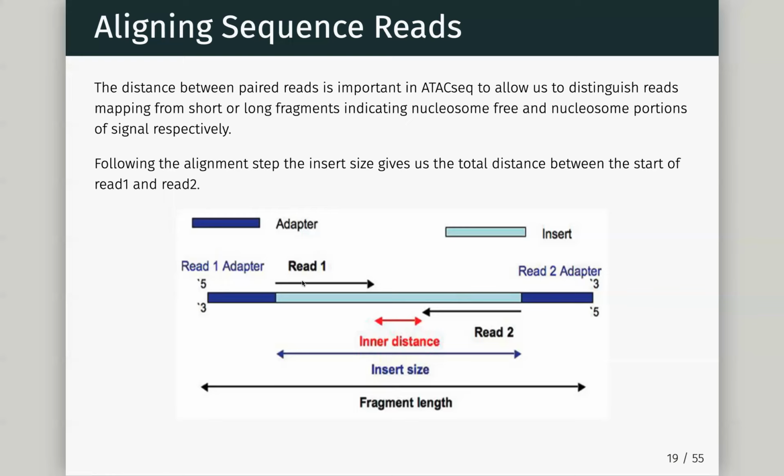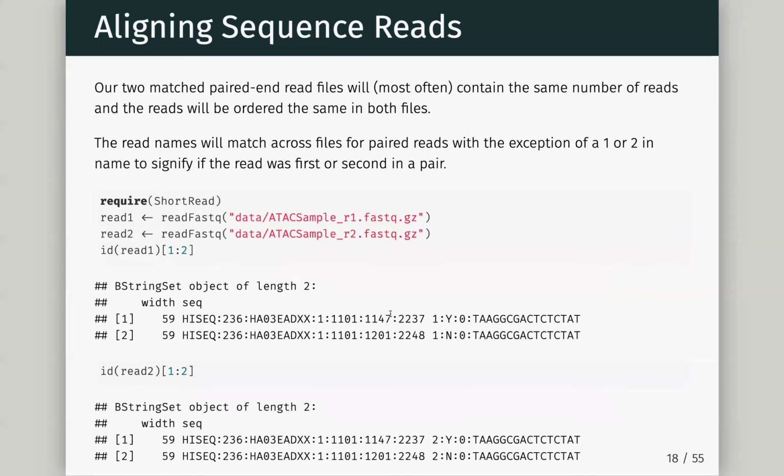Just the read 1. So it's this. So that bit in black here, that's what we're reporting for our first read. And then the second read will report this going this way, right? But backwards. Oh, because these are the read names, right? So this read name is the same across the two, but the sequence will be different. It may overlap in the middle, and then you'll be able to tell this. But yeah, this bit here is the ID.